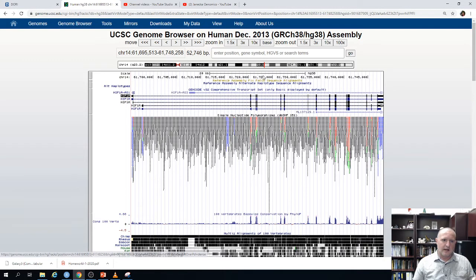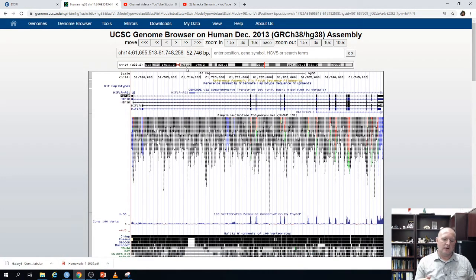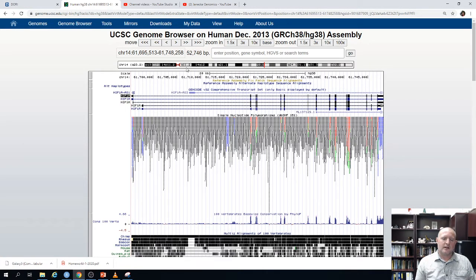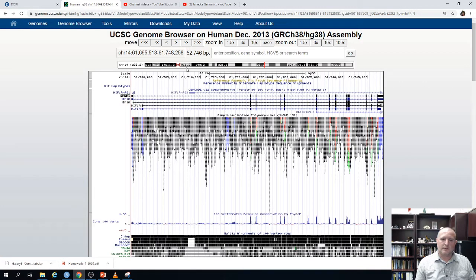Below the search bar we have a G-banding ideogram of that particular chromosome. All the genomic data is organized based on the original descriptions of chromosomes from G-banding and the quadrants created from it. The sequences are superimposed on those coordinates, and additional information on annotations, variants, clinical variants, repetitive elements, and conservation tracks are all overlaid on top.